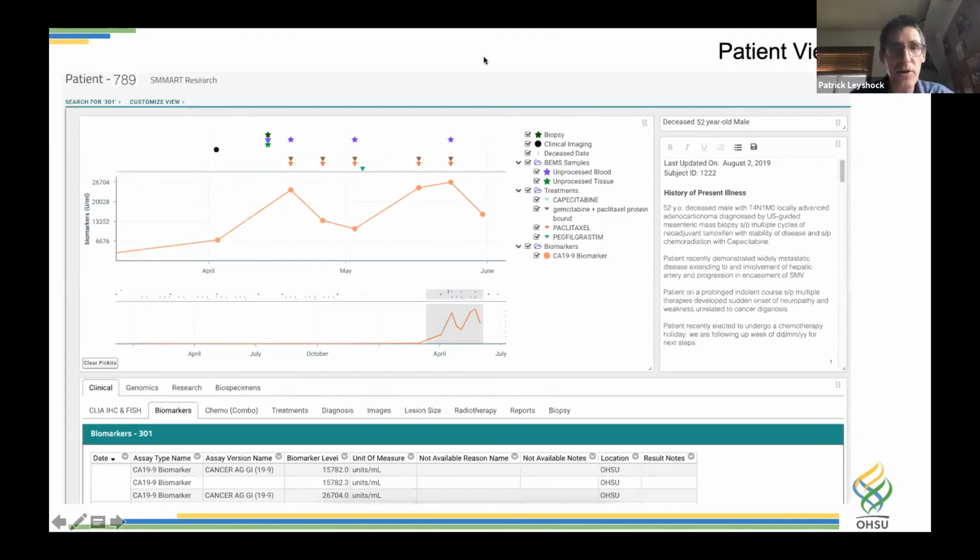So you can see a screenshot here. I'm going to pause and just let you take a look at this. So this is a view that we built on top of our LabKey server instance. It's pulling data from the platform. And again, this is a patient-centric view of data, stripped of PHI, of course.